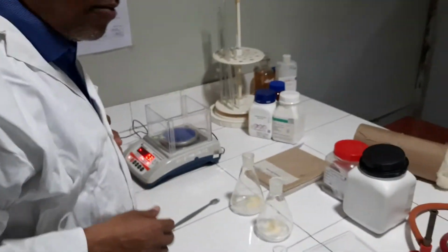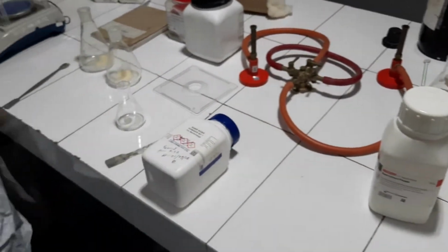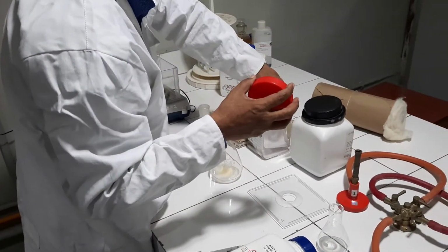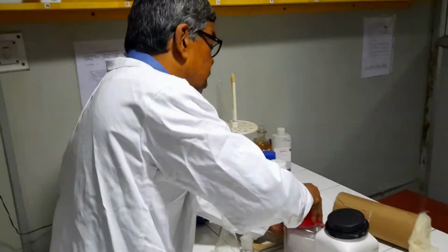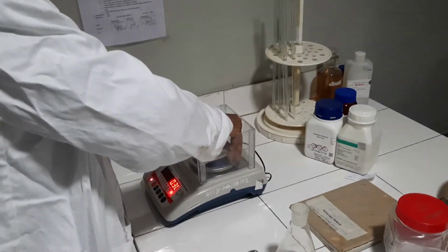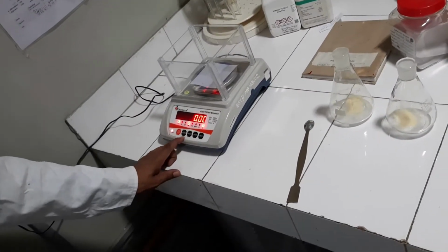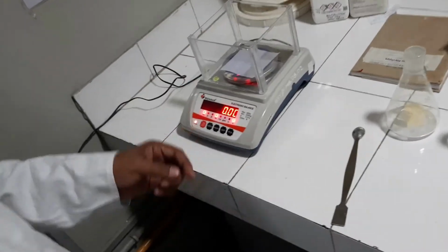Now the third item is agar-agar, only for solid media. So I take another butter paper, because beef extract was very hygroscopic and I have discarded the butter paper. Now this butter paper has been kept and it will be tared with the 0 setting. This is on, this is the 0 setting.